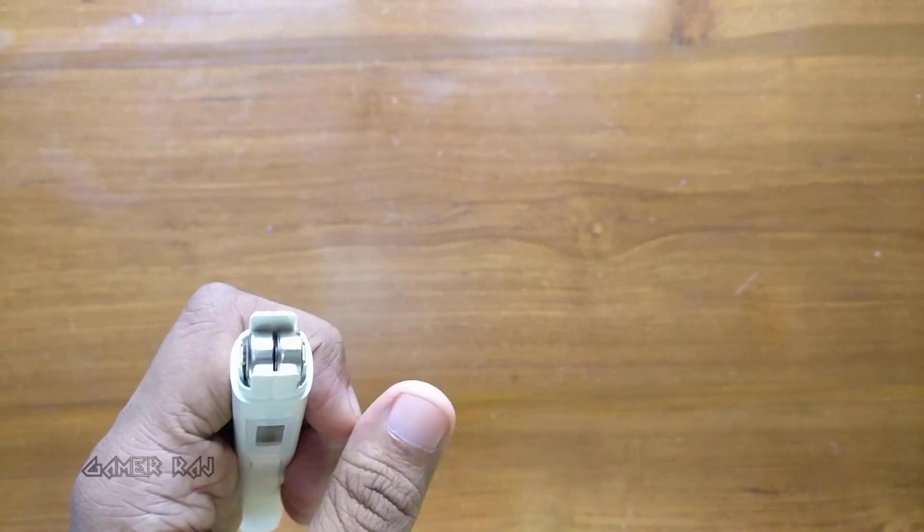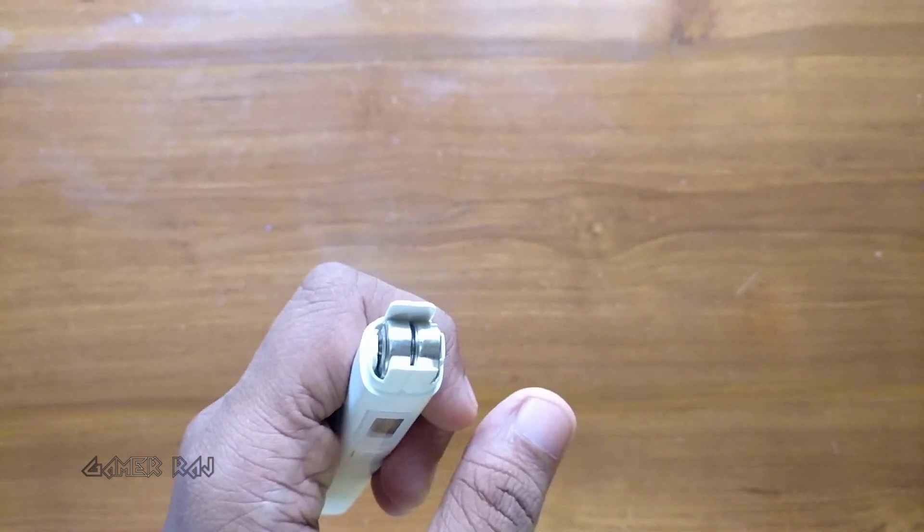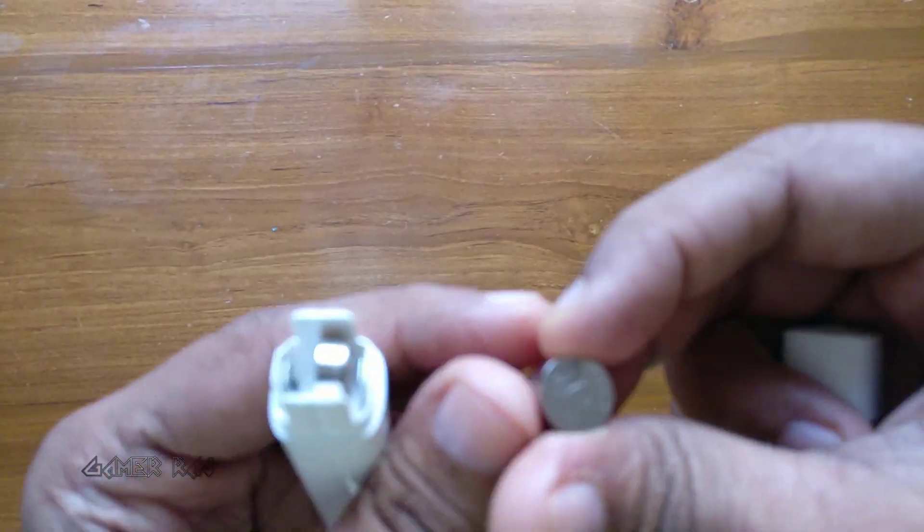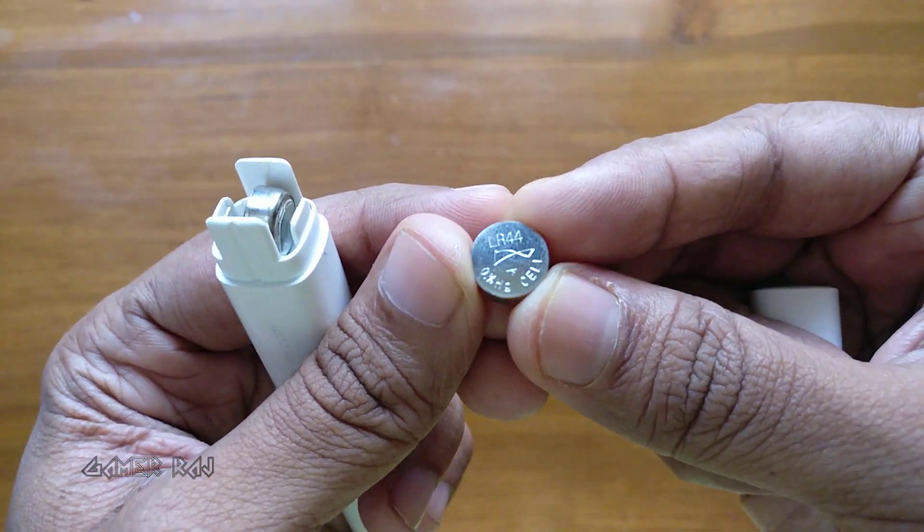The battery compartment holds 2 LR44 button cells. You can get these button cells at a really cheap rate from AliExpress.